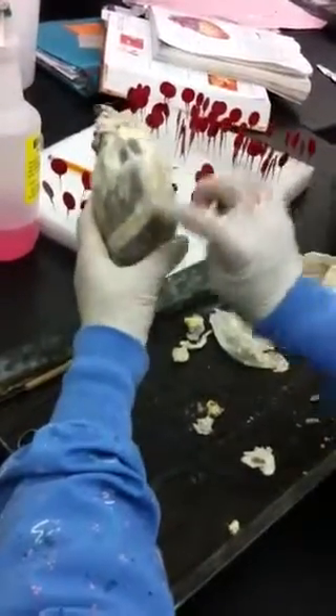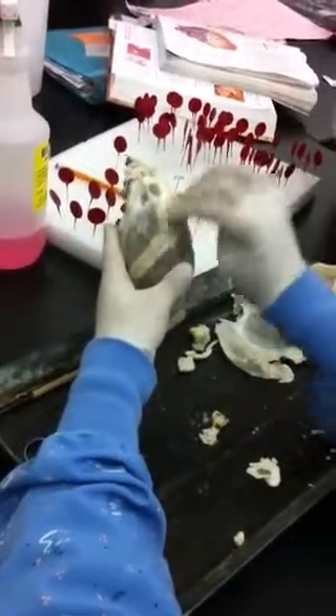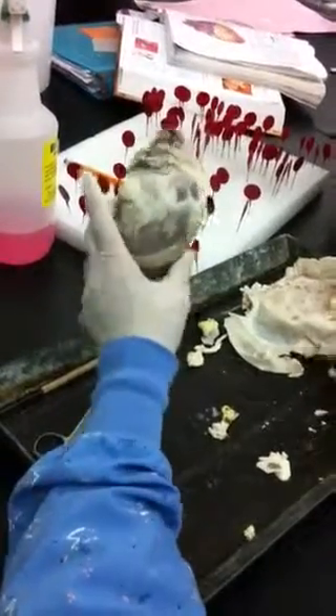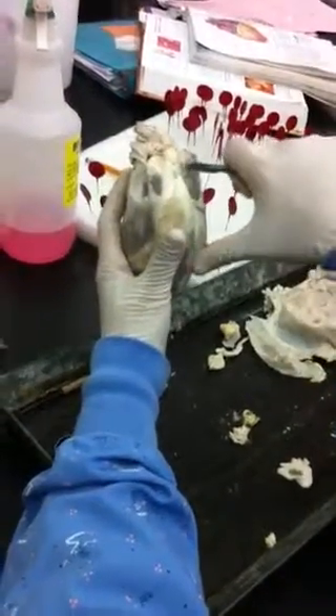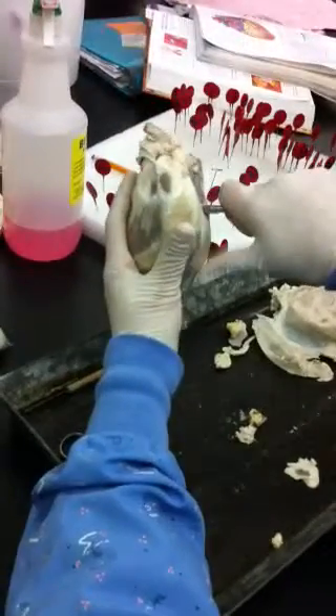Pulmonary trunk. And the sulcus is going obliquely — you see this is going oblique. So it's like that. Now we need to cut so that we can see the atria and the ventricles. I'm going to start cutting from here — that's the left auricle. So I'm going to start cutting from here and see what we see inside.